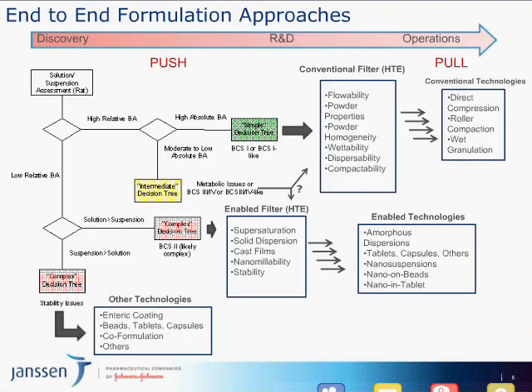So whenever you have a platform, there should be a philosophy behind this platform. This is our philosophy in developing high throughput screening. Many people talk about formulation development. In fact, formulation never stands alone. Whenever there's a formulation, it should be developed for a process.